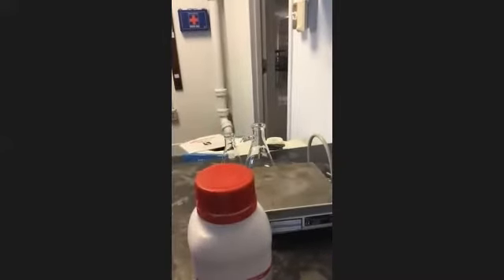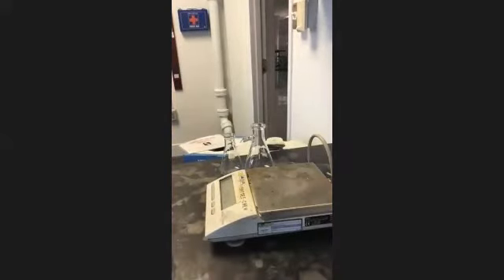Dr. Russell, you say you're gonna write the numbers on the board? Yeah. Okay. So we're gonna wait. I'm gonna weigh this stuff out. Then I'll put the density and molecular weight of acetic anhydride up there, and then I'm gonna turn the camera facing the board so you can get all the information down. Okay, thank you.